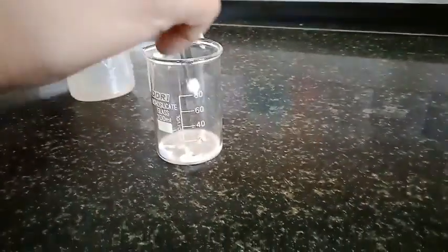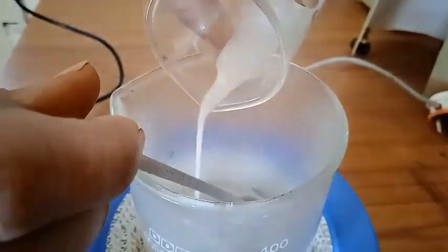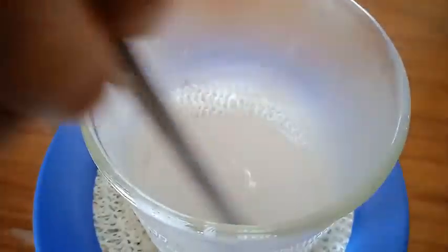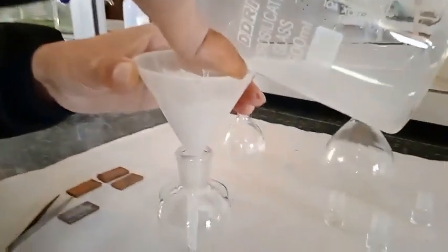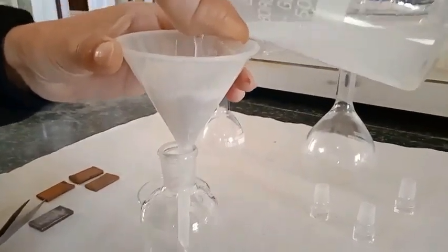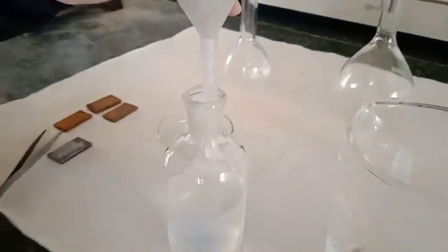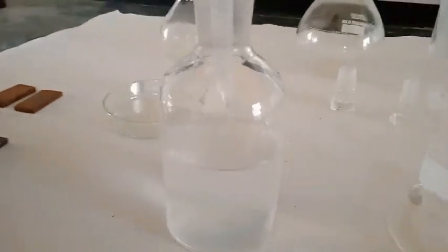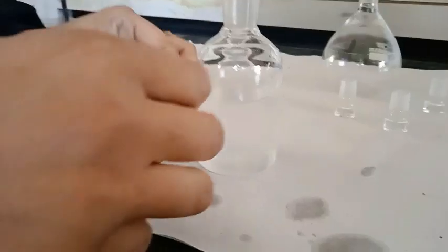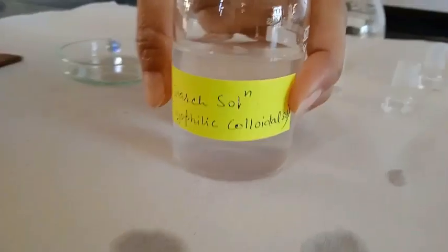The detailed procedure I am not going into here. So I am just going to pour it in the hot water and then boil for 2-3 minutes, and after cooling it down to room temperature, I am going to filter it into the reagent bottle. This will be used as internal indicator for iodometric titrations. This is my starch solution.